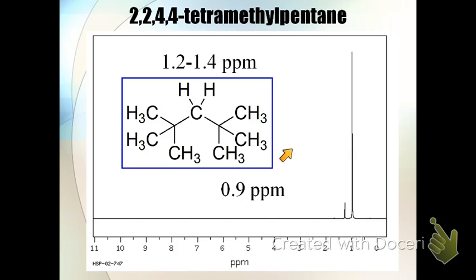CH3 groups have a characteristic resonant frequency of about 0.9 parts per million. That would be this signal here.